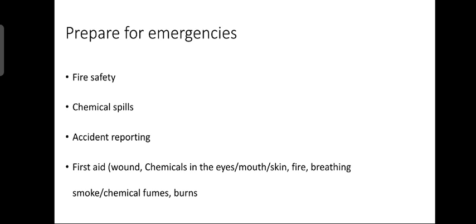Now, how to give first aid for chemicals in the eyes? Getting any kind of chemical into the eyes is undesirable. Some chemicals can destroy eyesight in a very short time. Flush your eyes with water in the eye wash immediately. Do not attempt to go to the office clinic before flushing your eyes.